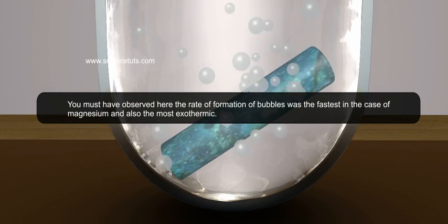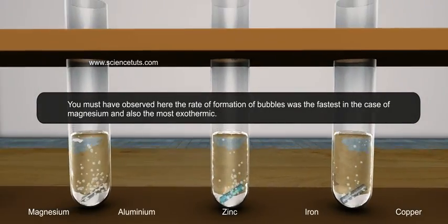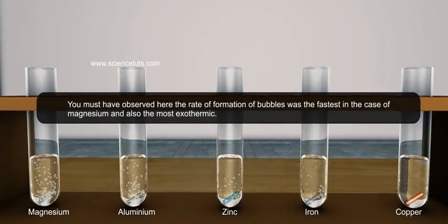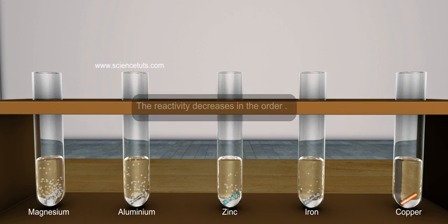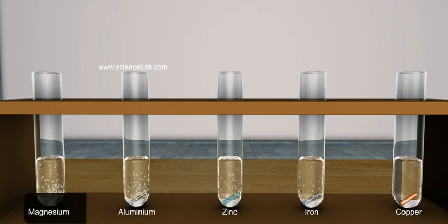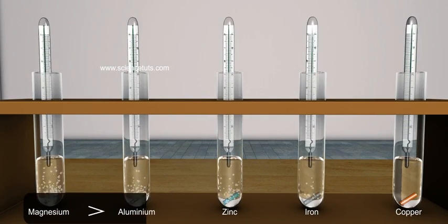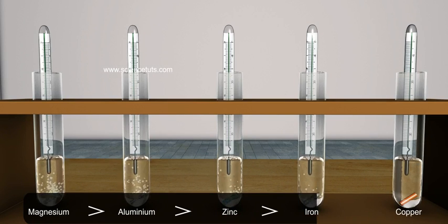You must have observed here the rate of formation of bubbles was fastest in the case of magnesium and also the most exothermic. The reactivity decreases in the order magnesium greater than aluminum, greater than zinc, greater than iron.